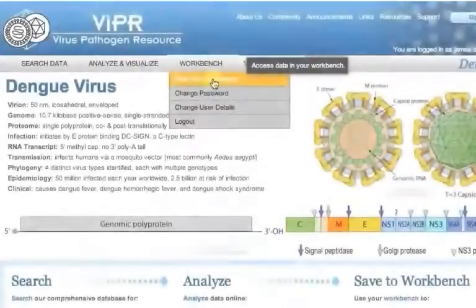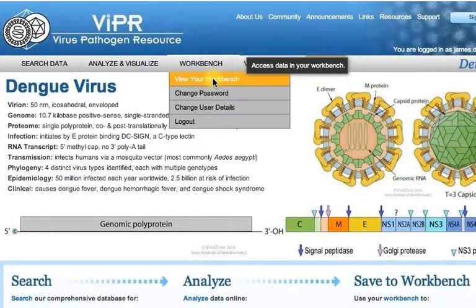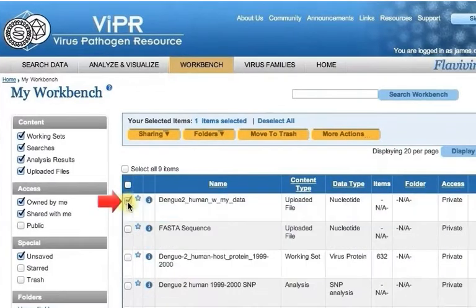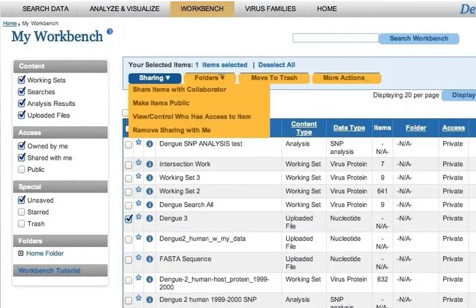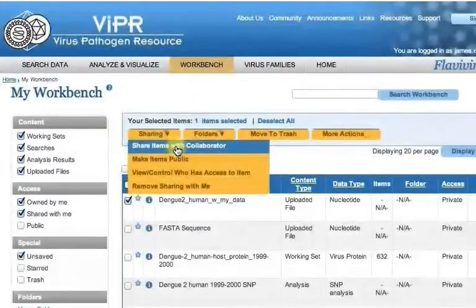First, navigate to your workbench. Then click the checkbox next to the item that you would like to share. Now mouse over the sharing button to see the available options. If you want to share the item with a collaborator, click Share Items with Collaborator to bring up the Invite Collaborators window.